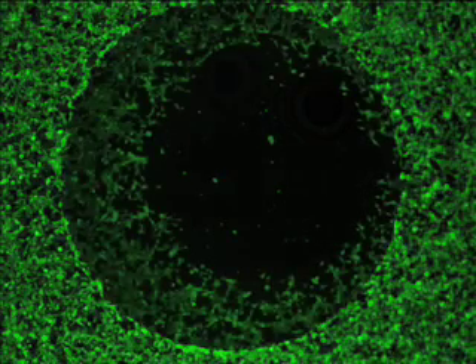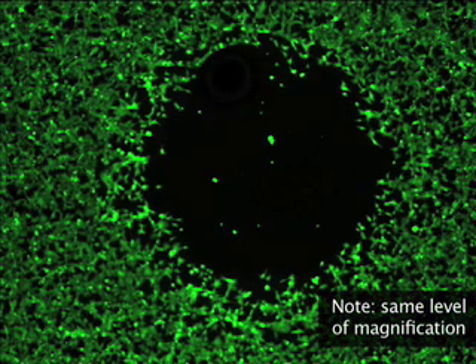Here you see an image of pre-migration, time equals zero, where the exclusion zone created by the stopper is visible. In this image, you can now see the cell migration that has occurred in the detection zone.